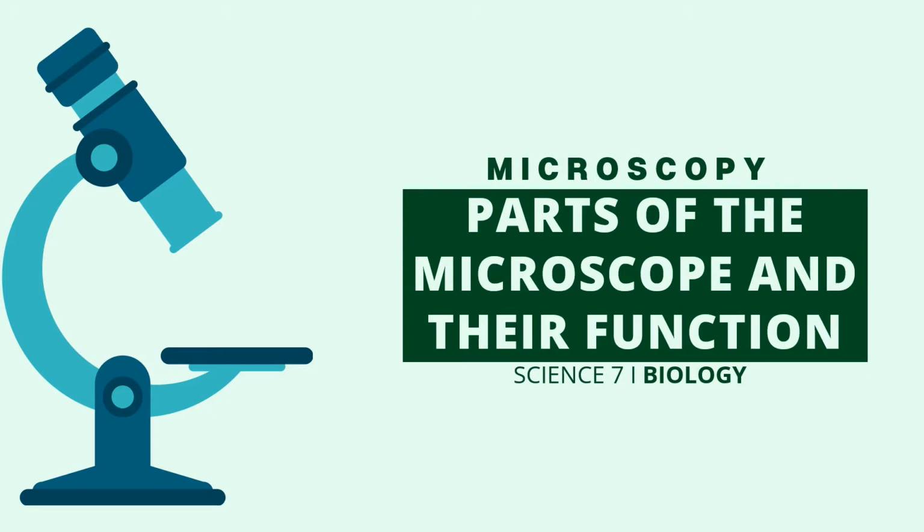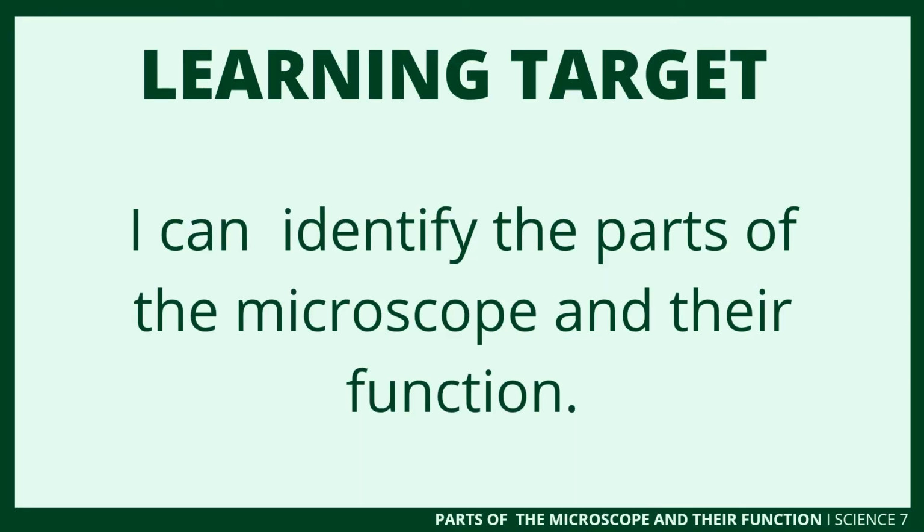Hello students! In this video, you will learn about the parts of the microscope and their function. At the end of this video, you should be able to identify the parts of the microscope and their function.